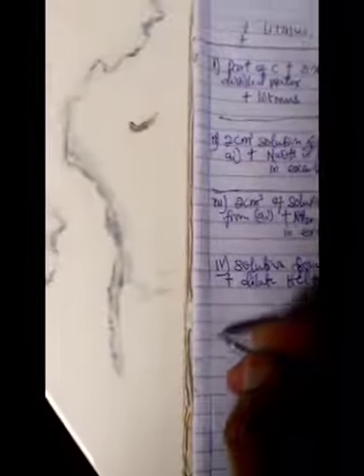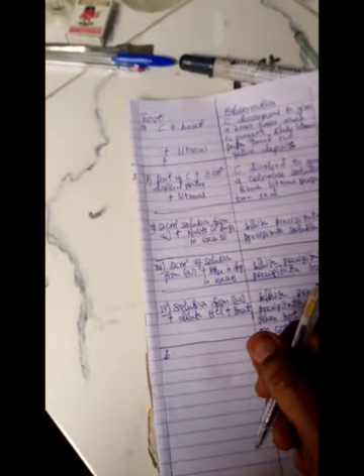Let's go to D, which will be number B now. Let's go to B. We might be asked to confirm potassium or we might not. Last year, they brought a sodium salt and this reaction was done. This year, they are bringing a potassium salt, so it might also be carried out. So what will that be?